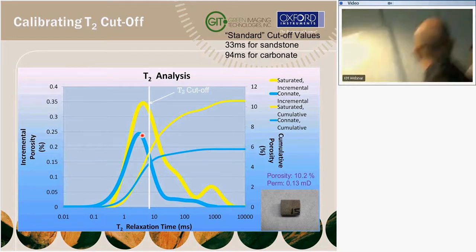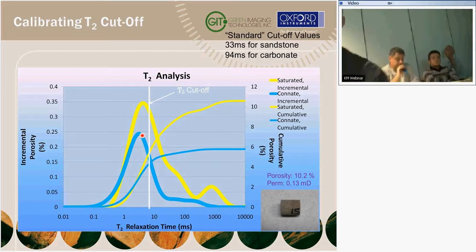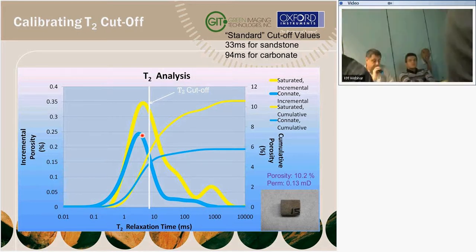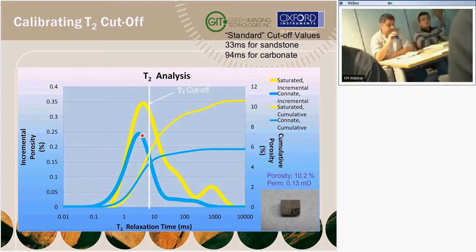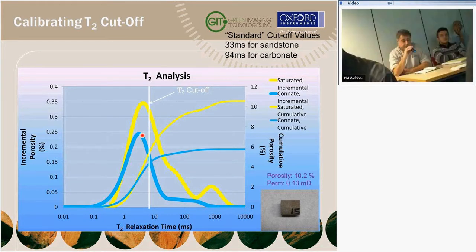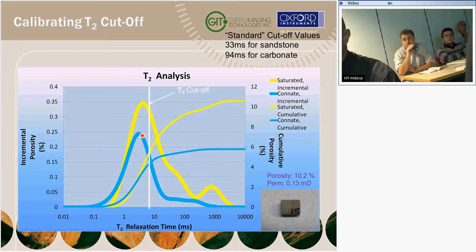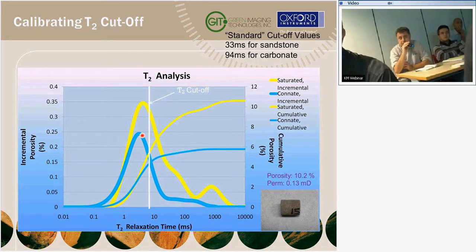One question, sorry, Maurizio Mele. You have mentioned that you suggest T1/T2 maps for fluid typing in gas shales. Do you think that the total amount of fluid in a gas shale system is enough to give a good signal for these kinds of fluid typing maps?